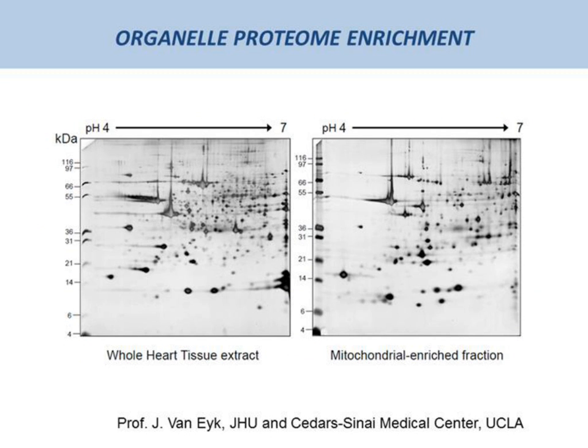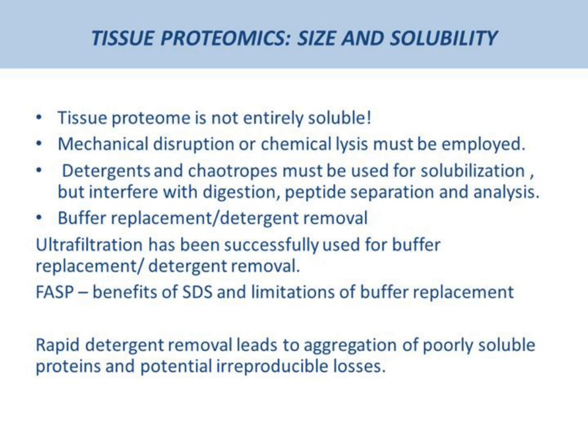While many laboratories are still pursuing biomarker discovery in biological fluids, a recent paradigm shift to tissue proteomics presents new challenges for sample preparation methods, such as solubility, stability, and a few other issues. Protein dissolution requires detergents and chaotropes that interfere with downstream analysis. In addition, there are many more challenges related to real-world samples, such as lysis of particularly tough tissues, for example, bone, hair, skin samples, etc., several resilient species of bacteria, plant tissues, as well as protein extracted from complex matrices, such as food, soil, or fecal material, and so on.